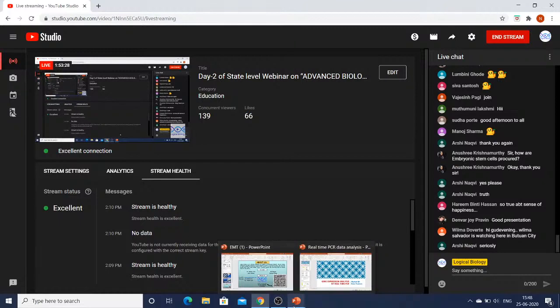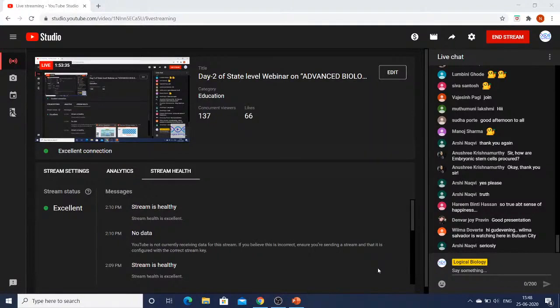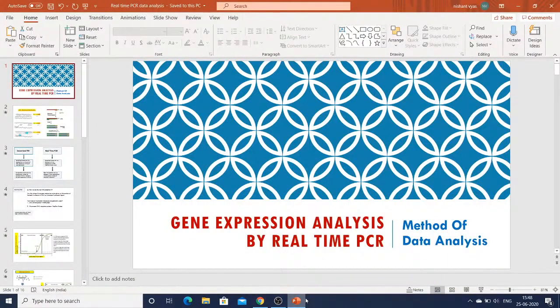So, the next topic which I am going to discuss is real-time PCR. A little bit technical, so we'll try to understand it. I will try to explain it as simply as possible, and let's enjoy real-time PCR. I hope you are able to see this PowerPoint presentation. It is gene expression analysis by real-time PCR.